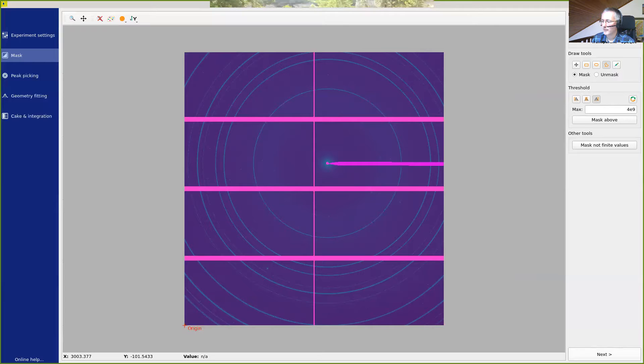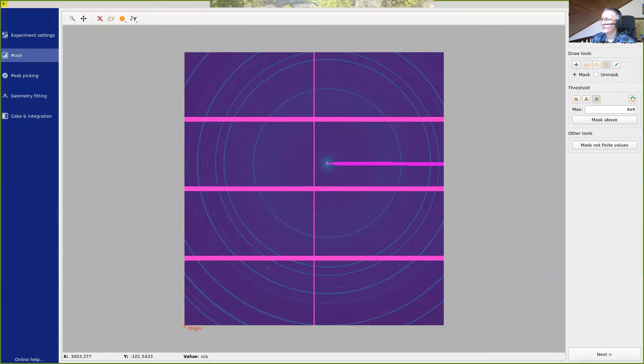So once the mask is drawn and we are happy with it, we can switch to next. If we want to save the mask, we have a button here to save the mask to a file.